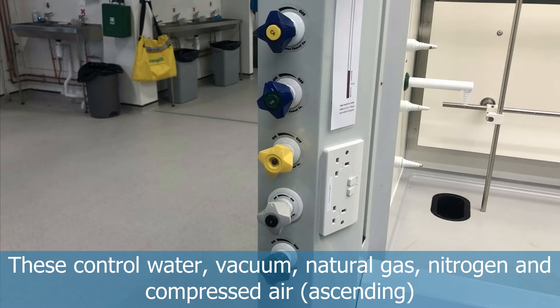Going up from the bottom, the tap types available are: water taps, vacuum, natural gas, nitrogen, and compressed air.